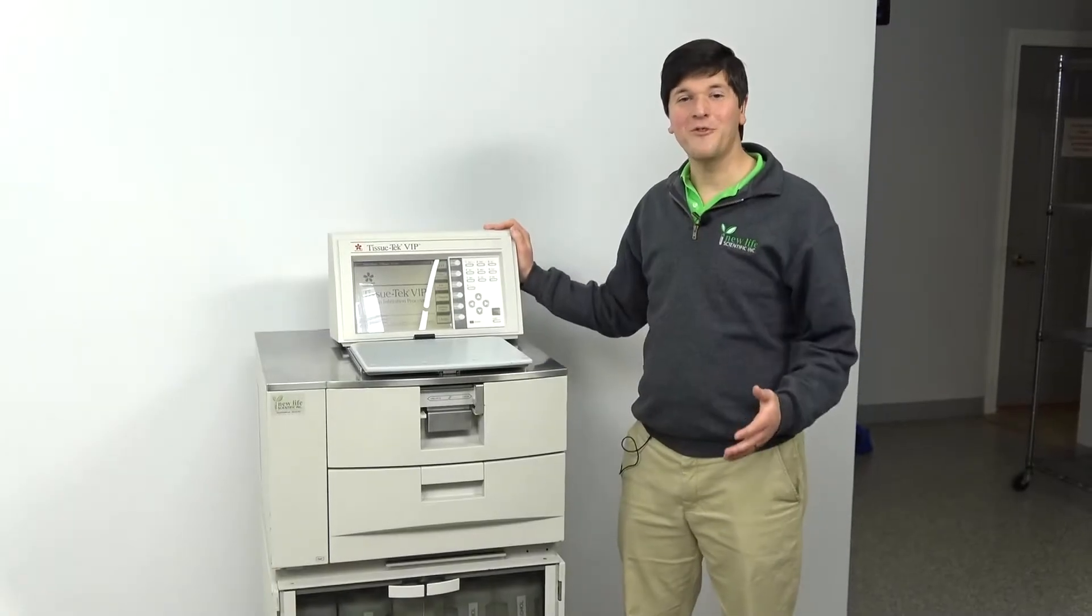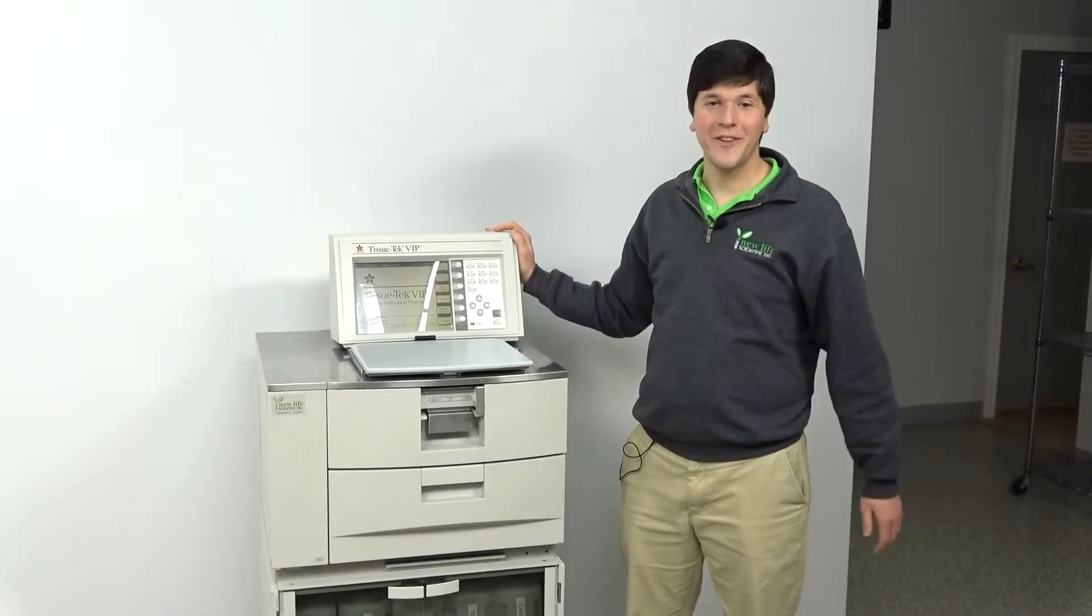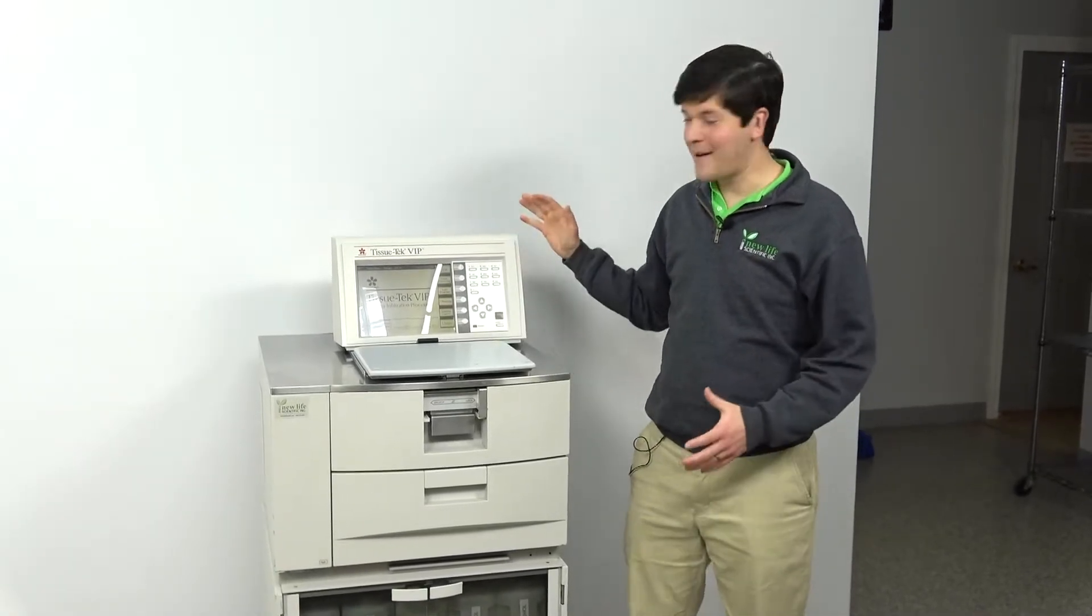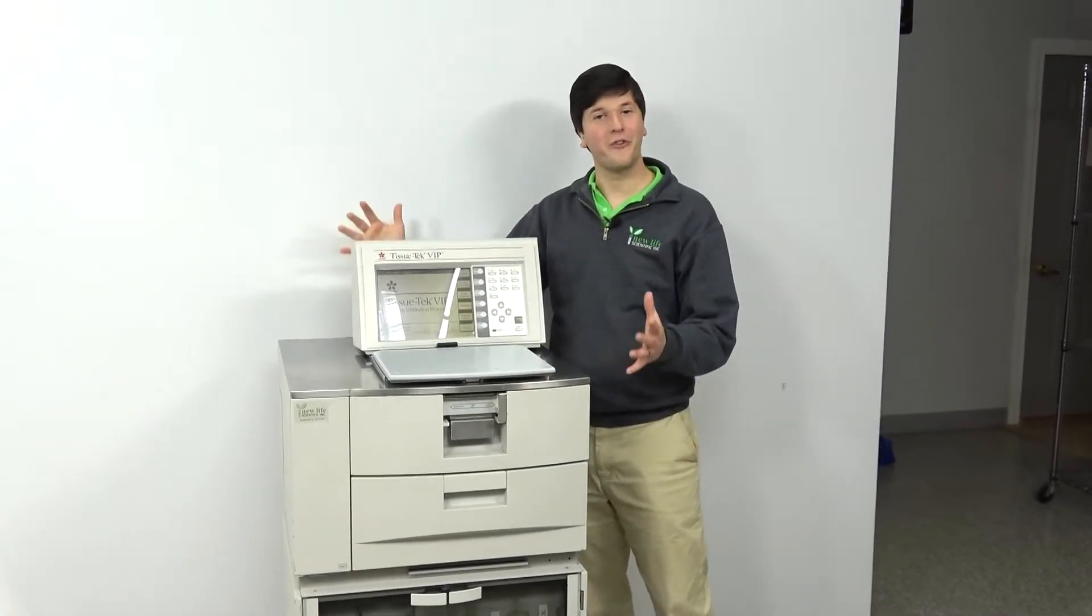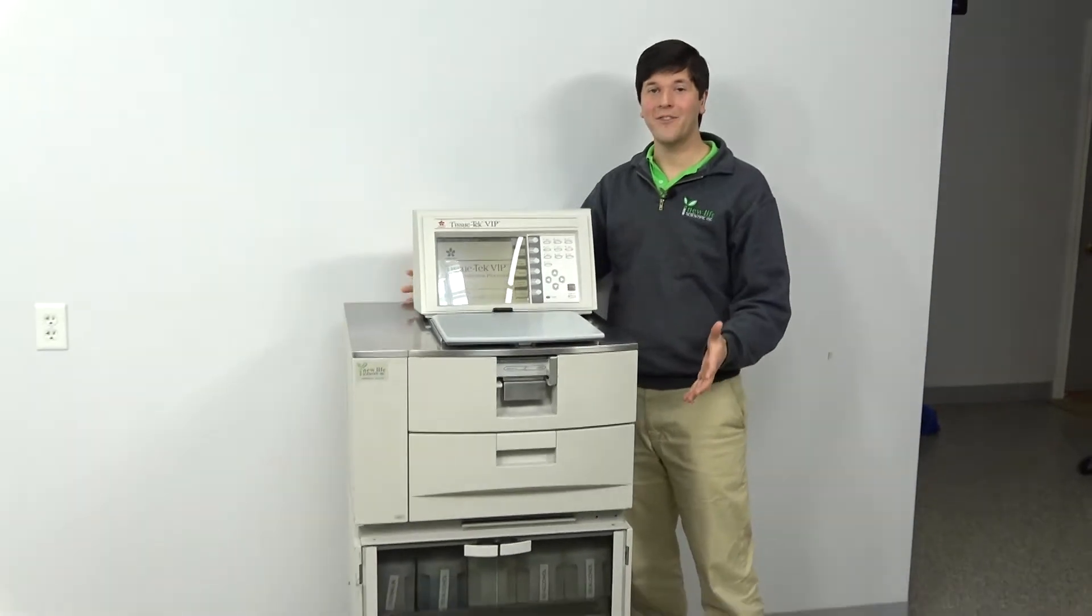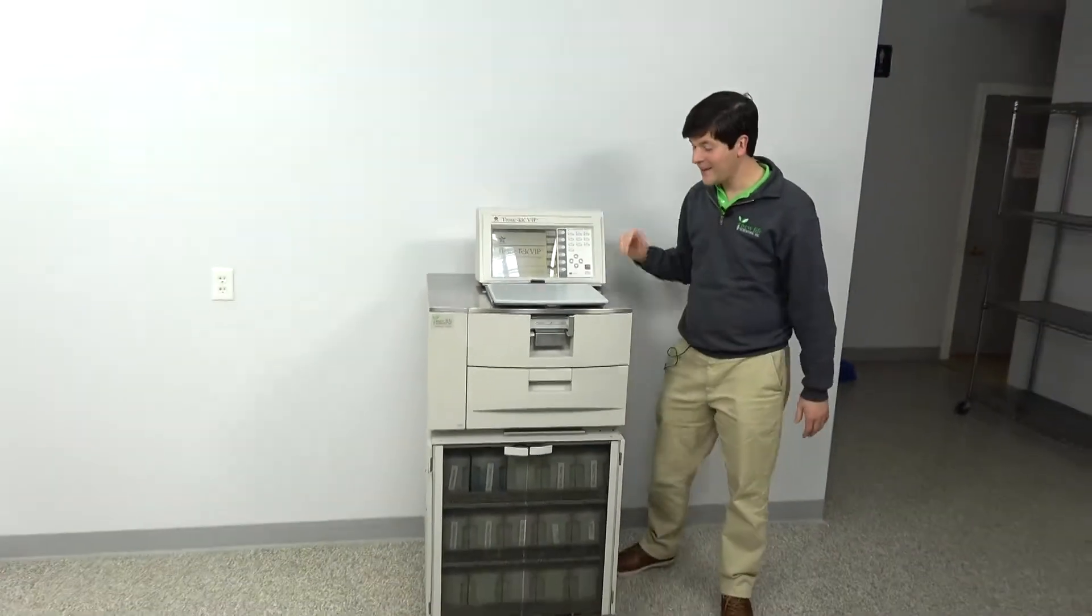Hi there, this is Nathan from New Life Scientific, and today I'm just going to show off a VIP 5 that we've got in.